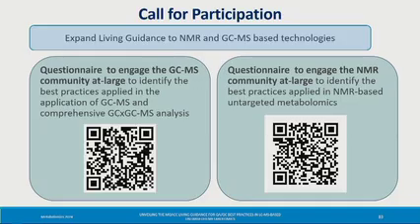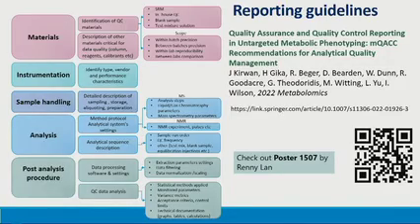And finally, as I promised to one of the people who asked a question, we do have a reporting standards paper that has a checklist of things that should be reported in terms of quality control. You can check out this paper, and Renilan is going to present a poster on this, poster 1507, so come talk to him directly if you have questions.